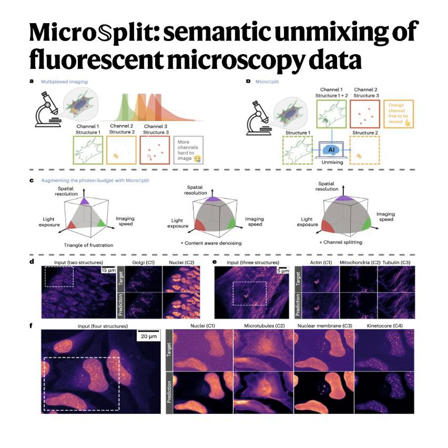Lean LC, regular LC, and deep LC. Yes, so if you're running this in the lab, you can essentially choose your horsepower. They scale up in GPU memory demand, but they also scale up in how cleanly they unmix the data. Right, but MicroSplit is only half the equation here.